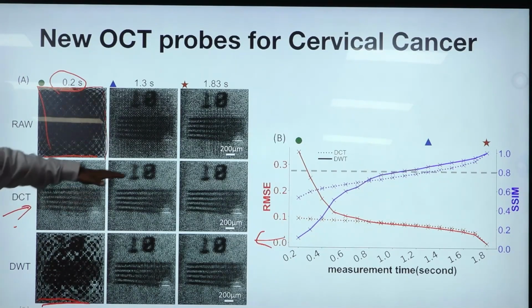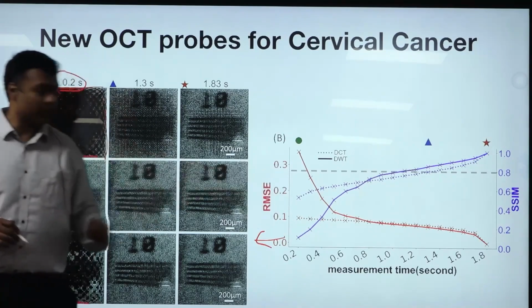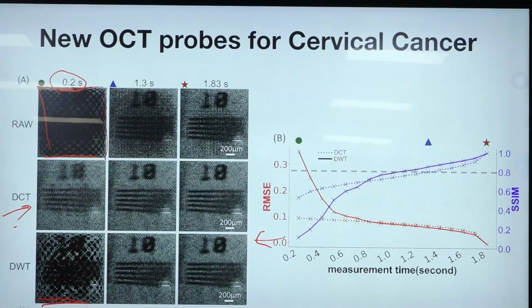We were able to show and quantify this approach to scanning, the device that we built, and the fact that it scans in this particular manner, using that scan to improve the speed of data collection with computational approaches.